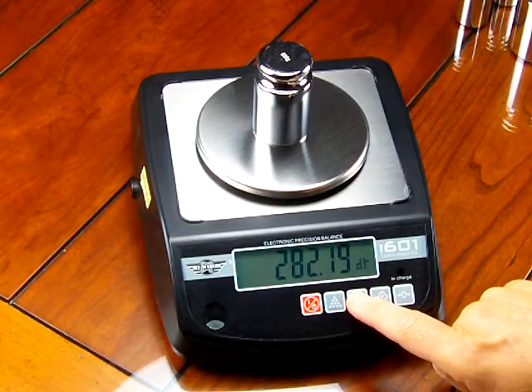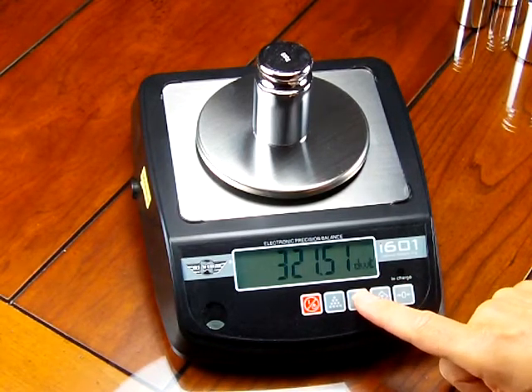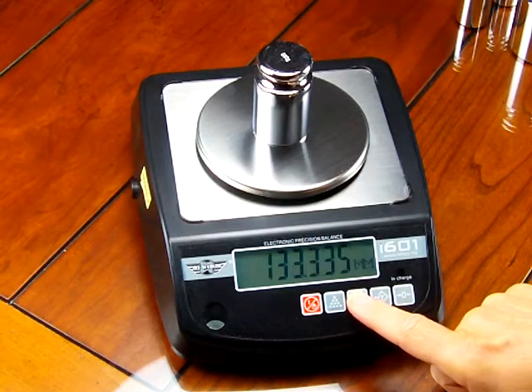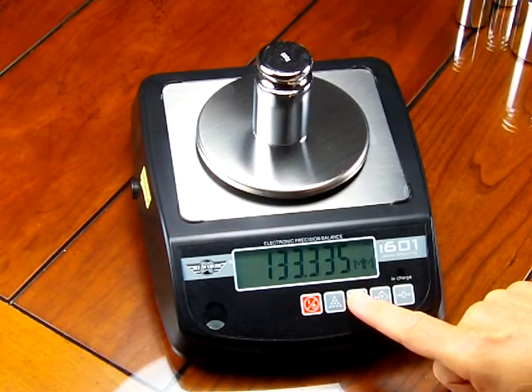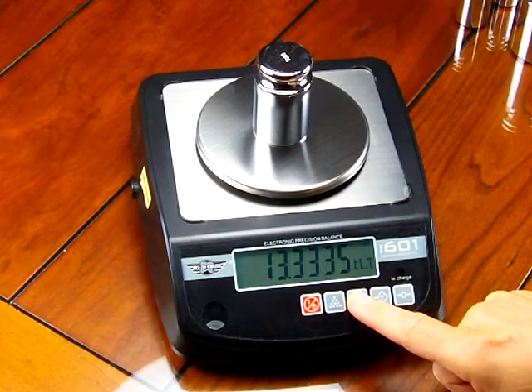I don't know what this is, even DR. Then I have grains. This looks like penny weight. DWT is penny weight. This is mummy, something used overseas.